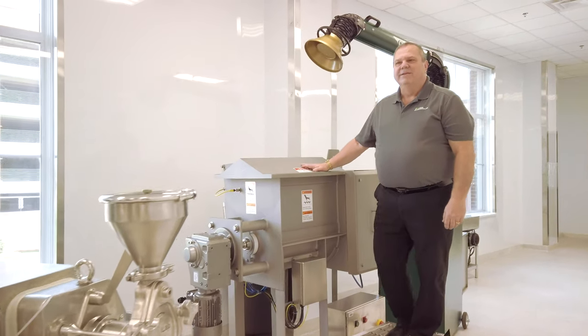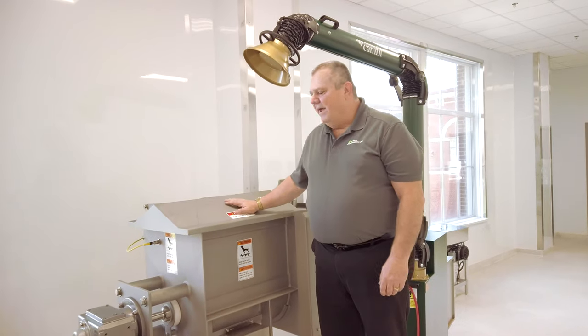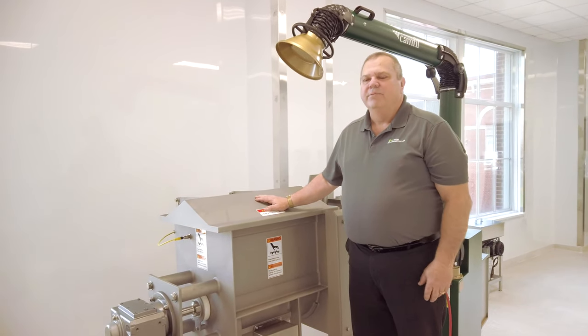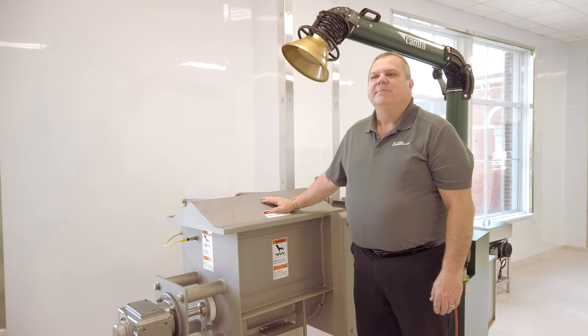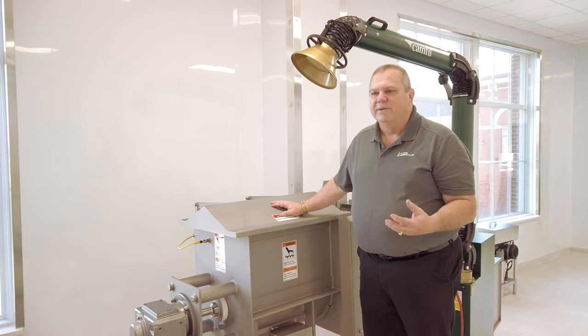Many powdered products need to be blended together after different powders have been manufactured. Here we have a paddle blender. We chose a paddle blender over a ribbon mixer simply because it's a gentler method of blending powders together without shattering the particle size.